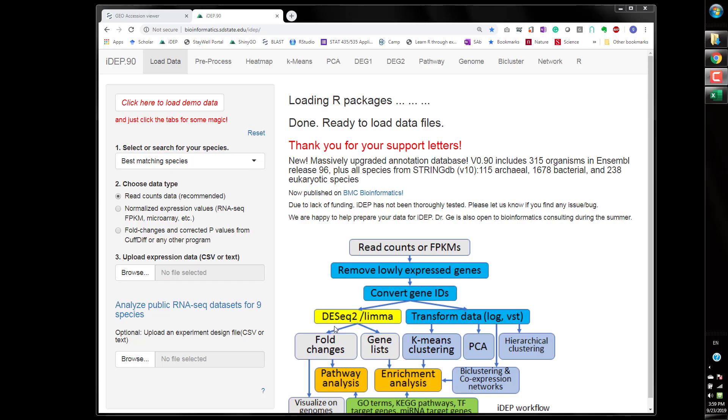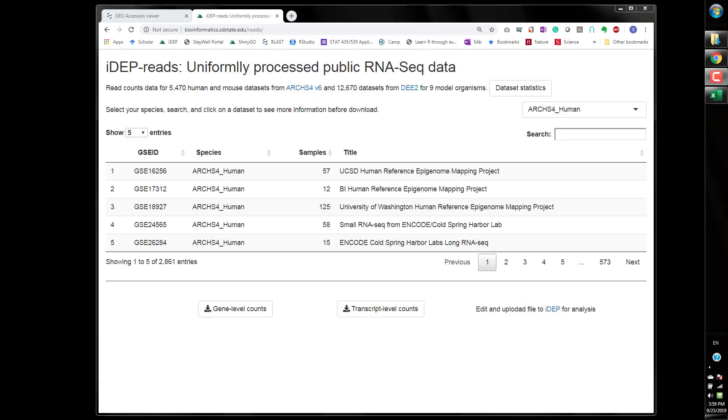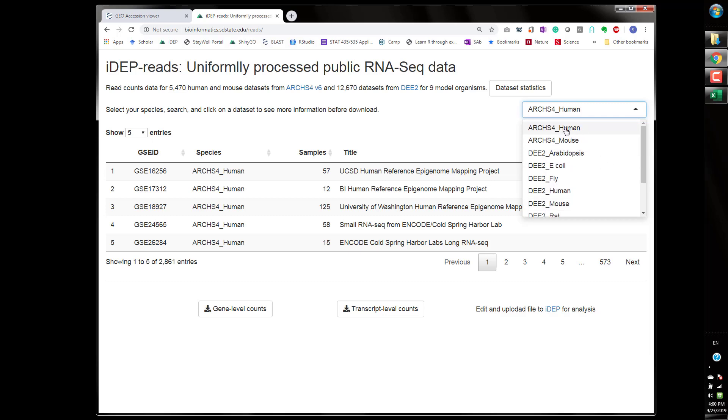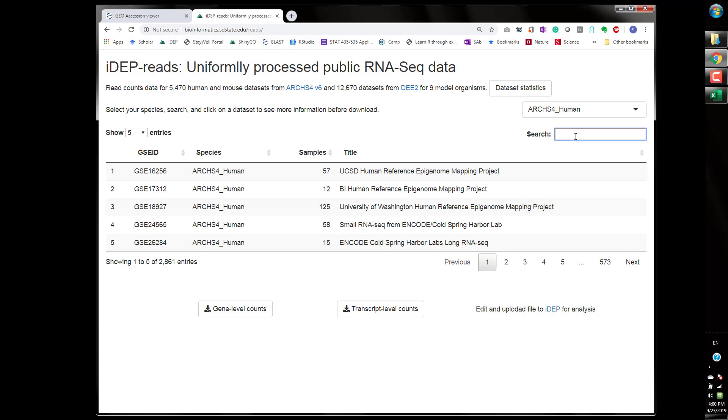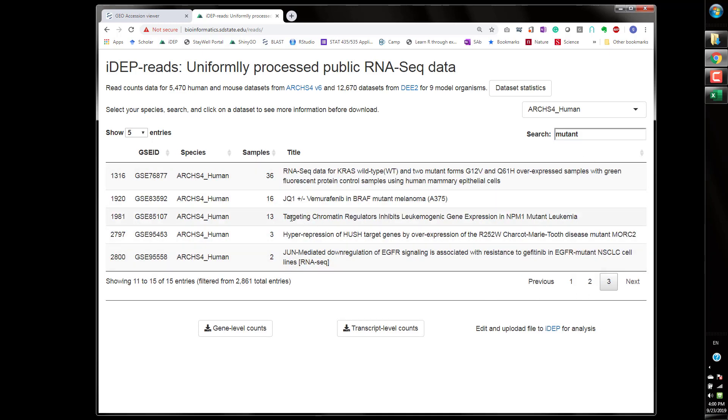To get started, we will go to the iDEP website and click on analyze public data. Here there are many different sources of data we can download. We're going to use ARCHS4 human and use any keyword to search for data. I used a very generic mutant and then I have found this data and clicked on it to start downloading.